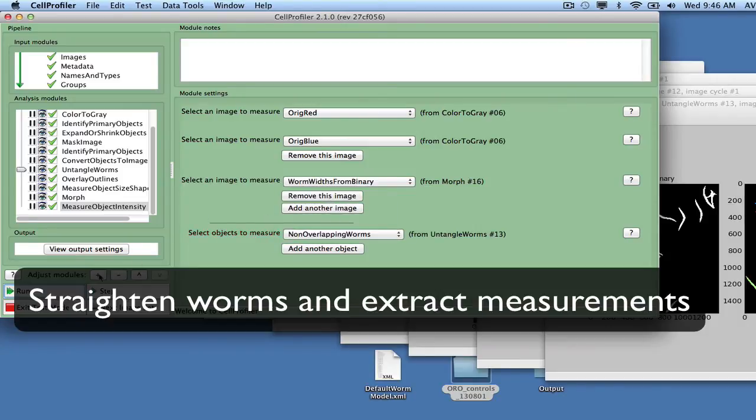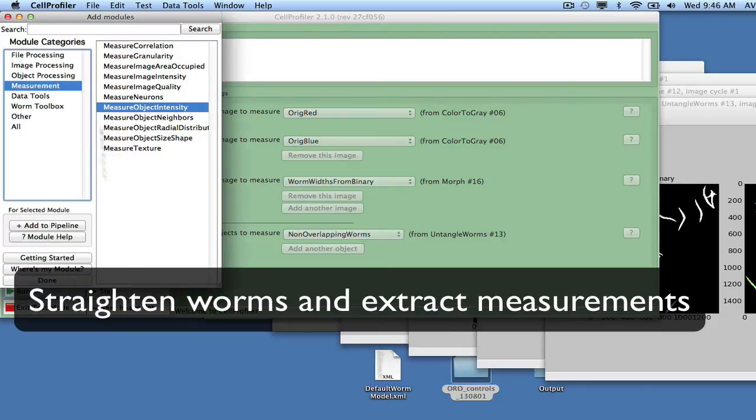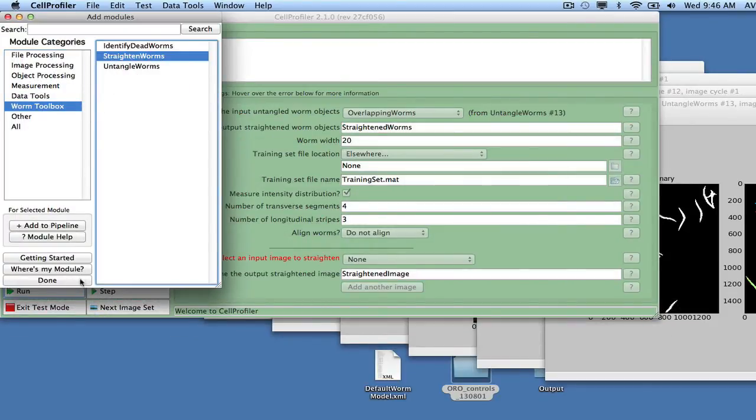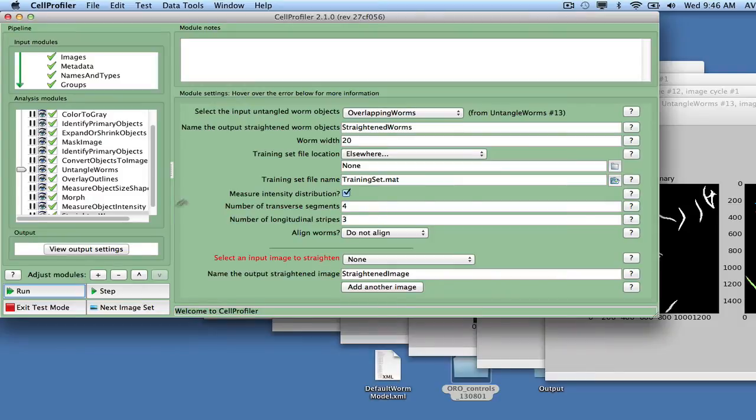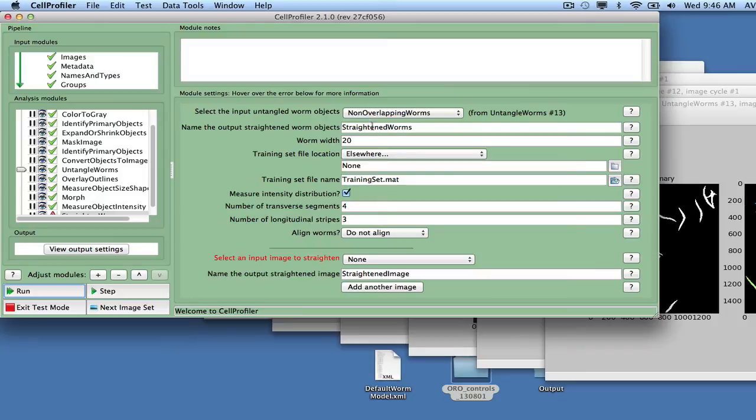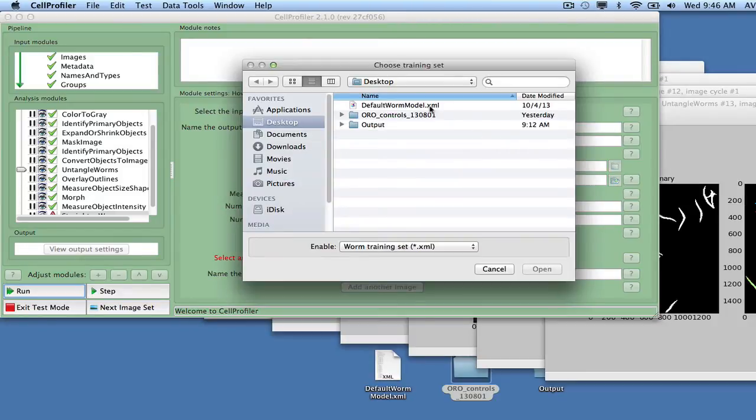The Straighten Worms module from the Worm Toolbox extracts intensity measurements from sub-regions of the worms after digitally straightening the worms and dividing them into a fixed number of transverse segments and longitudinal stripes. These measurements can provide information on where fat is located inside the worm.